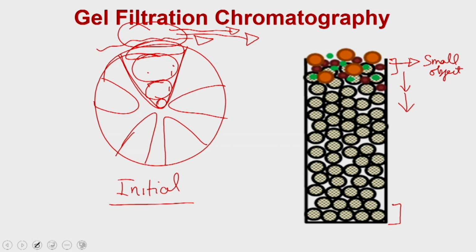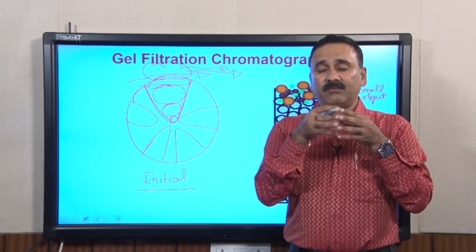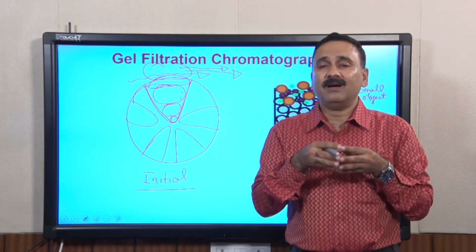So, if you have a confusion that every bead is going to have the molecules of these sizes arranged in the pores, then that is not true, because the dynamics of these molecules are very different. Because of their sizes, the dynamics of the small molecule is going to be very large.